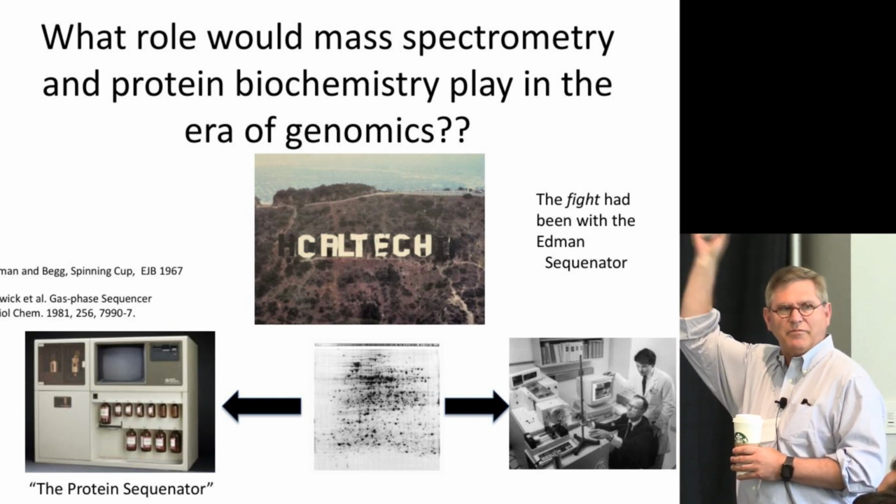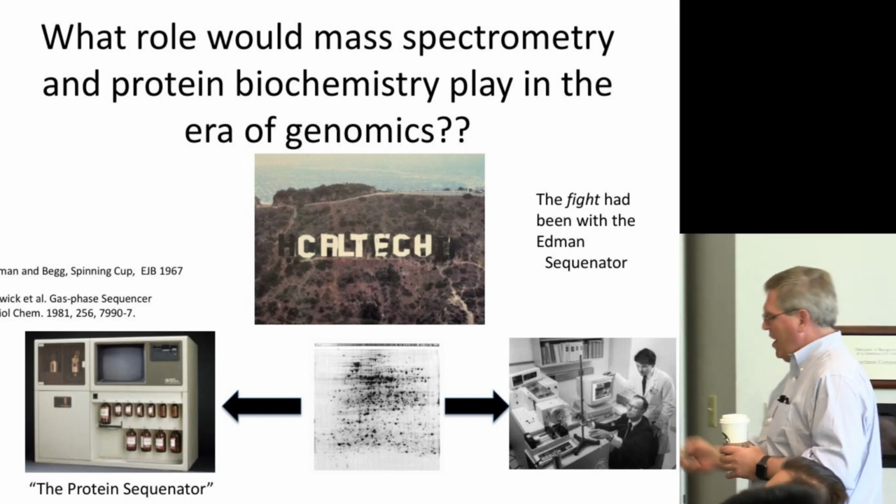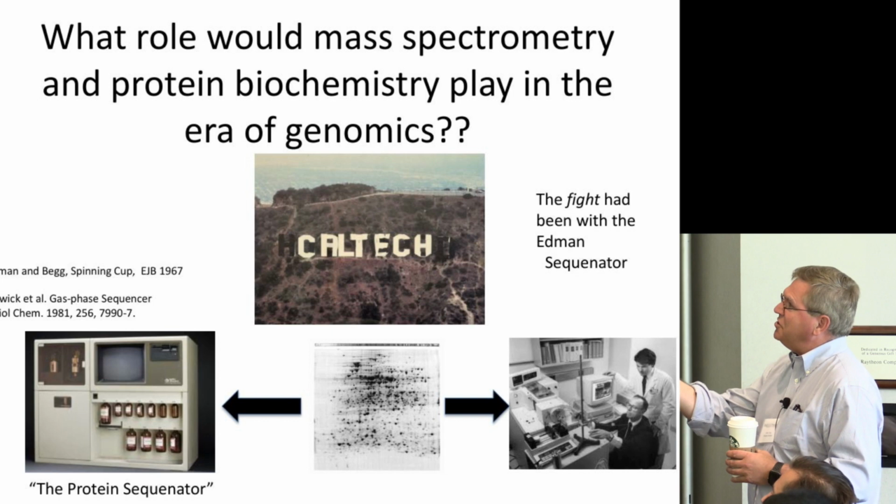Anybody here know Edman sequencing? Yeah, so a few people. And also the big thing was 2D gel electrophoresis.